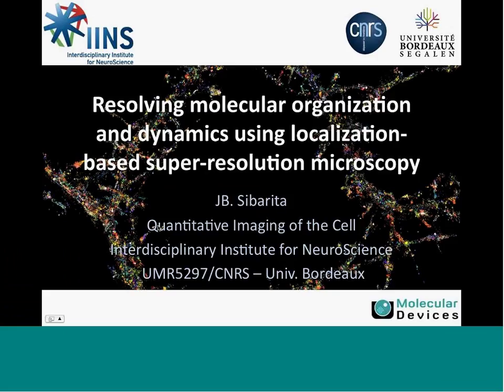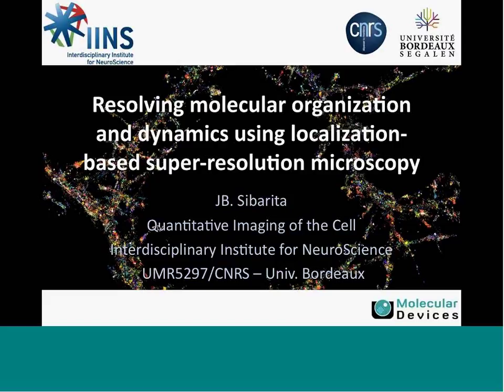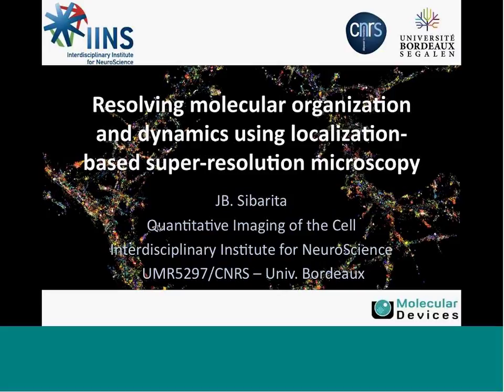Okay. So I'll present you some of the latest developments that we have done in my team inside the Interdisciplinary Institute for Neuroscience in Bordeaux, dealing with super-resolution microscopy, and more specifically with localization-based super-resolution microscopy. My talk will be divided in three main parts. In the first part, I will reintroduce the concept and how, thanks to localization of single molecules, we can overcome by a factor of almost 10 the limit of resolution due to diffraction.